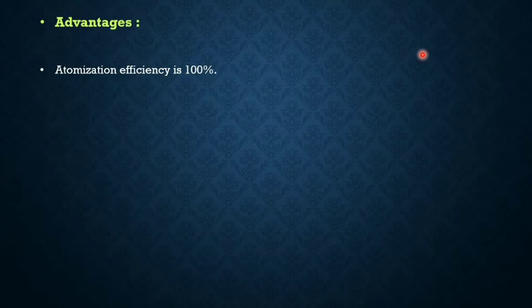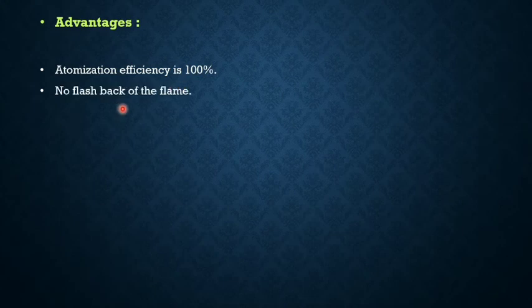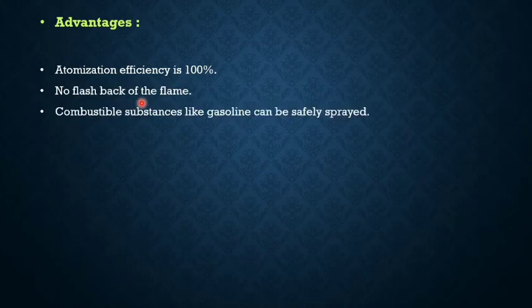The advantage of this burner is that atomization efficiency is 100%. There is no flashback of the flame. Combustible substances like gasoline can be safely sprayed by using this burner. The disadvantages are what?